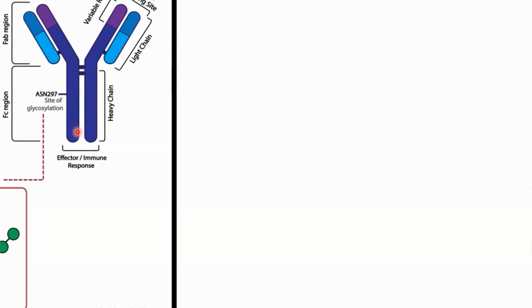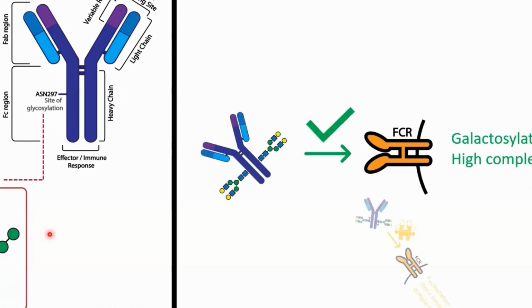Usually for mammalian glycosylation, we have a typical, what we call a chitobiose core, which is these two N-acetylglucosamines and three mannoses, as well as then decorating up towards different sugars that can be there. So something like this, which is Man5, G2, and this could be G2S2F, for example. So depending on what sugar is there is going to influence things.